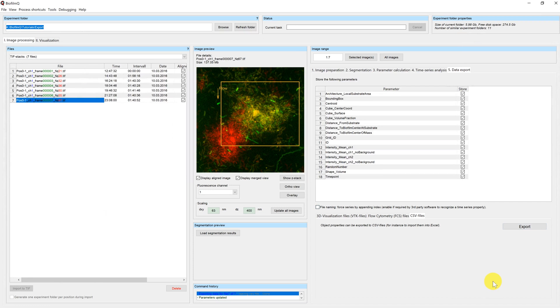This was our short tutorial on Biofilm Q. If you are interested in other workflows, please refer to our other tutorials.